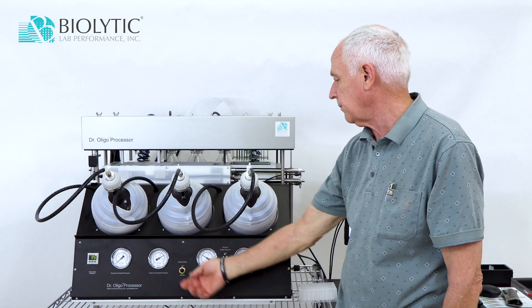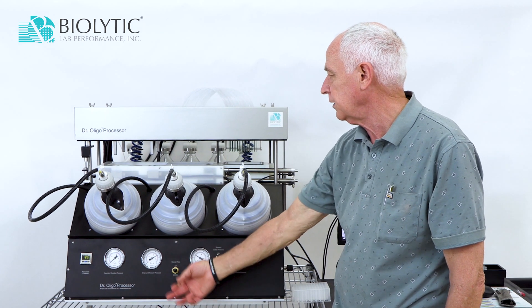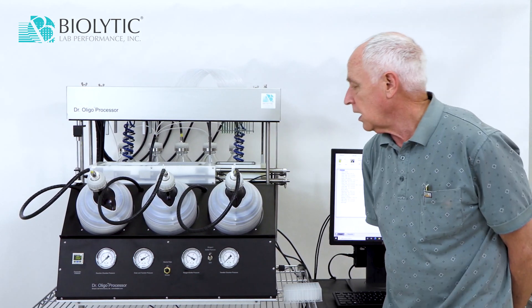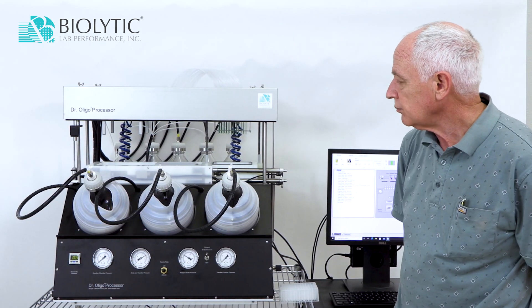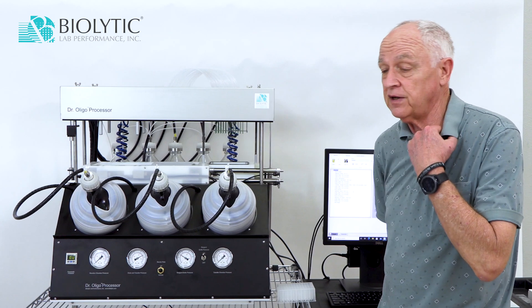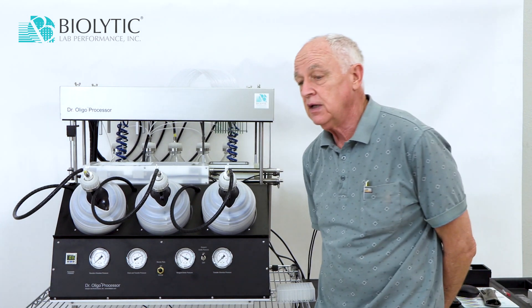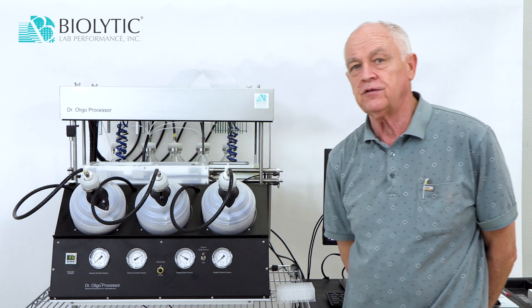If I'm going up, I can stop anywhere along the way by just letting go of it, or raise it all the way up. The instrument was designed to be generic so you can do various types of processes with it using different cartridges from different suppliers.